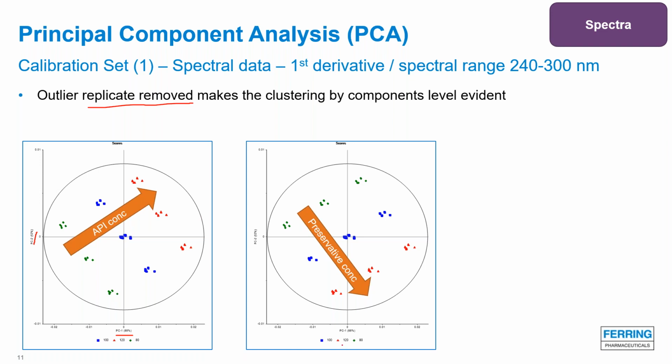So that means using these PC1 and PC2, we are actually being able to retrieve where are the samples, or to map from the spectral data and using PCA to which composition of sample we are looking at.